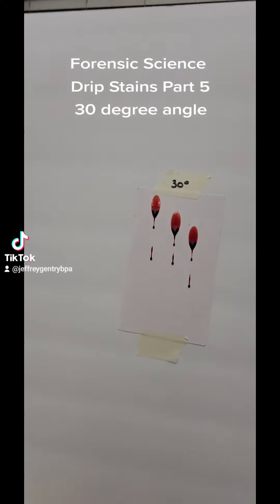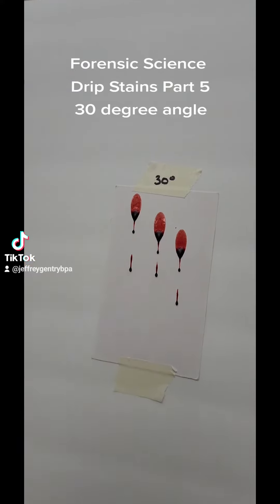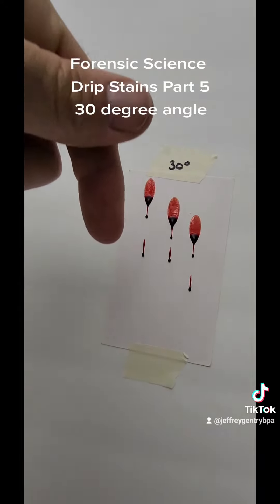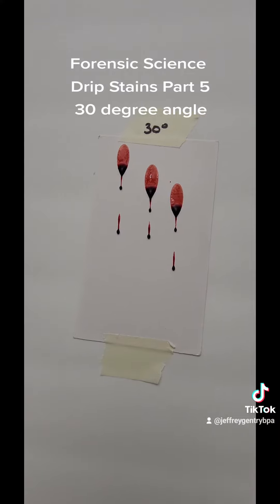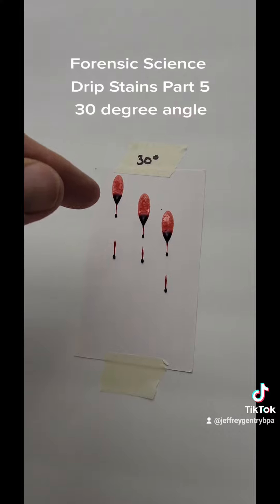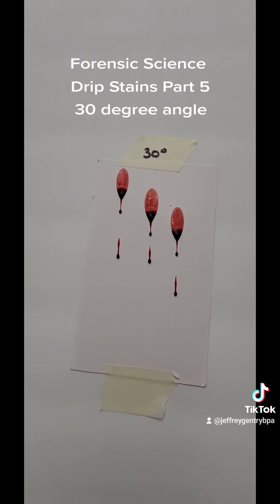These are obviously more elliptical. What's cool about these is you can actually start to see what you would see in an elliptical stain where they have a tail. With impact spatter stains, you can tell what direction they hit the surface because they have a little tail — the tail points in the direction of impact. This would be called an associated drop or a satellite stain because it's connected to that blood stain, but it's really an artifact of the degree angle of impact. Once the blood hits the surface, it projects out in the same direction, and it's lined up with that stain, so it has the same directionality as the elliptical stain.